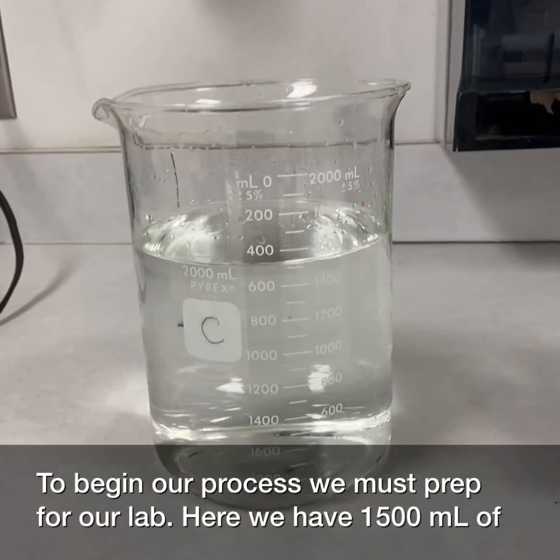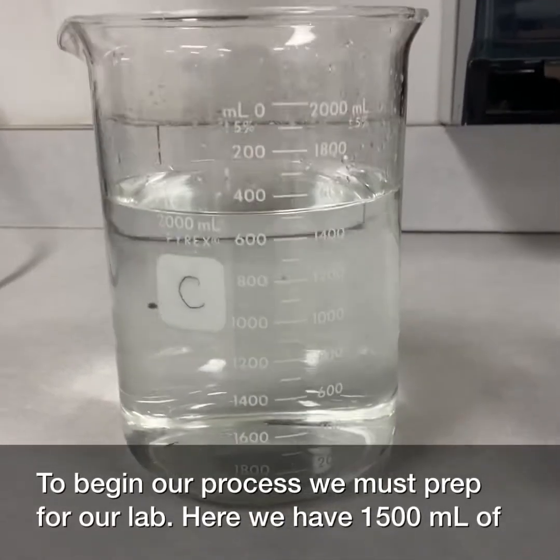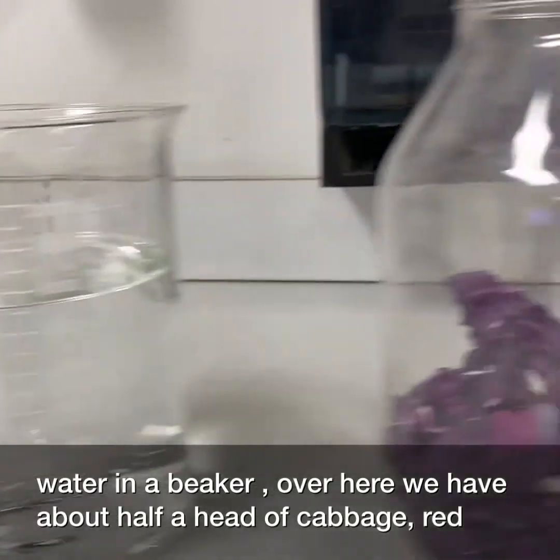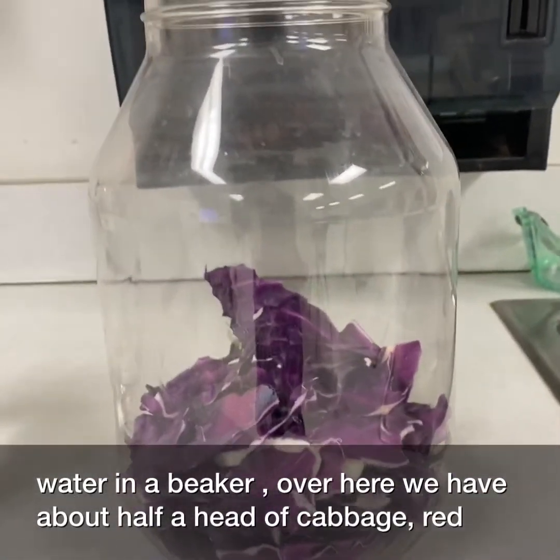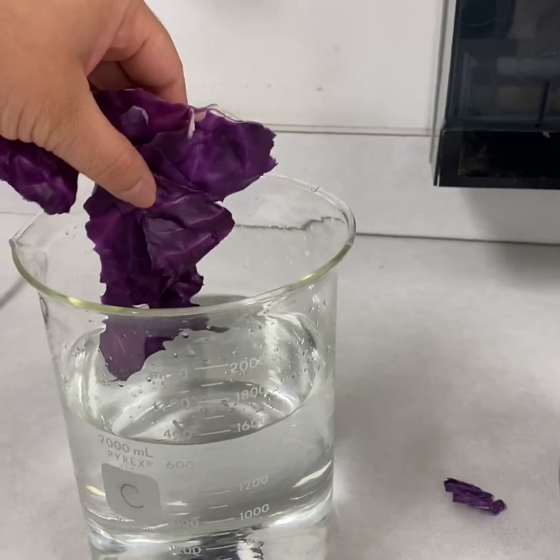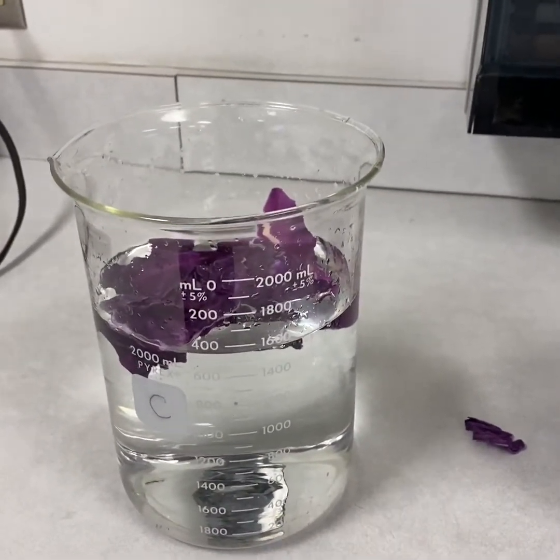To begin our process, we must prep for our lab. Here we have 1,500 milliliters of water in a beaker. Over here, we have about half a head of cabbage, red cabbage to be specific. Begin by taking some of your red cabbage and putting it into your water. You're going to put all of the cabbage into your water.